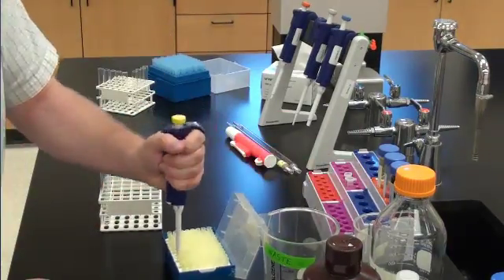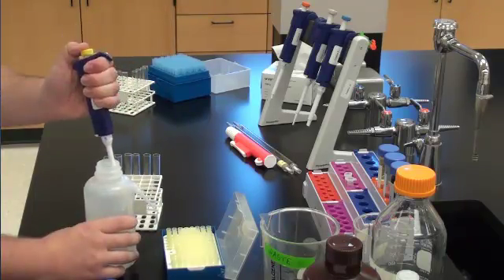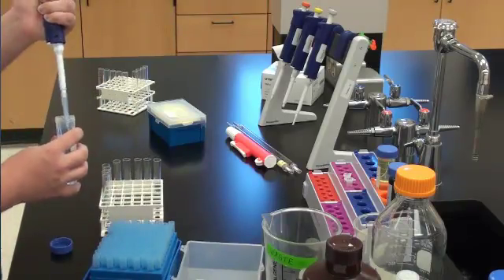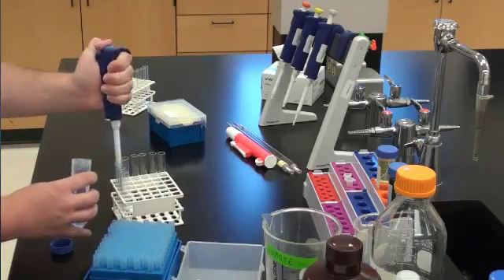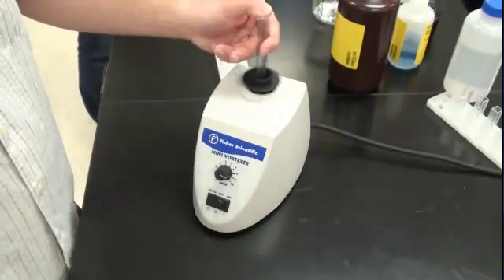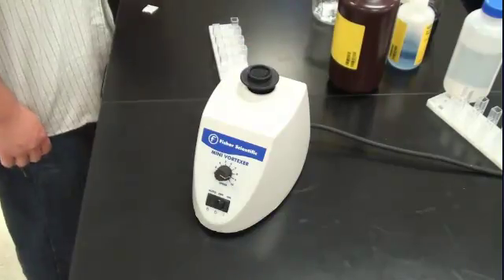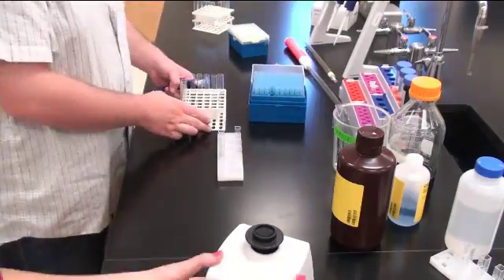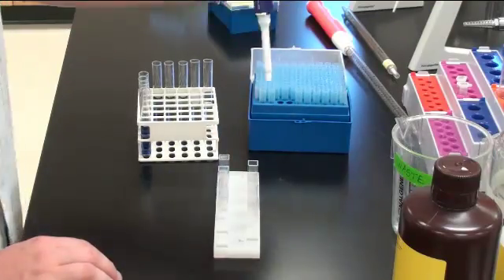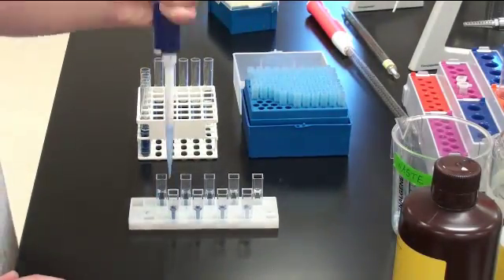You then repeat this step using the immunoglobulin G and your unknown, so you will have three sets of test tubes, but you do not need to create additional blanks for each set. Next, you will add 500 microliters of reagent A, the Biuret reagent, into each test tube and gently vortex. Then using a 10 to 25 milliliter pipette and a pump, put 4 milliliters of reagent B, the Folin reagent, into each test tube and again vortex. After each test tube has been mixed, you will wait 15 to 20 minutes for the color to develop. While you are waiting, you can take 1000 microliters from each test tube and transfer it to a cuvette so that when the time is up, you are ready to measure your absorbance.